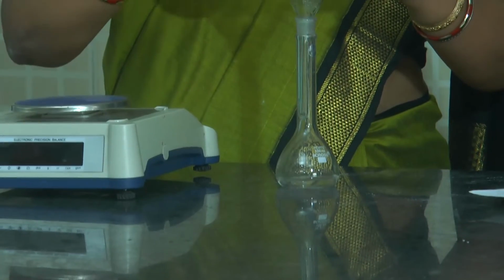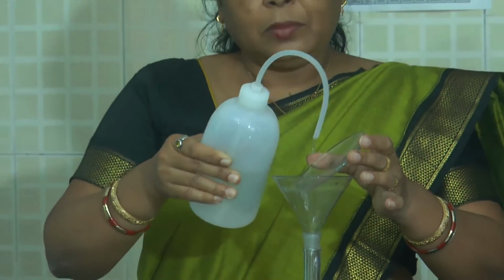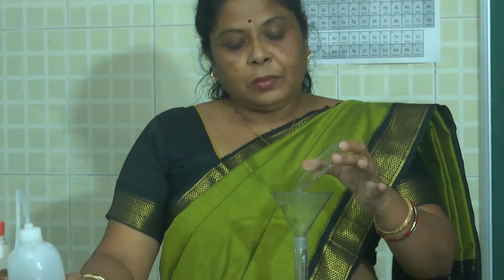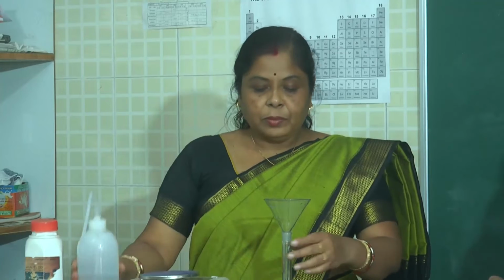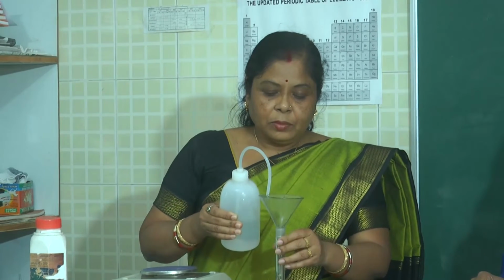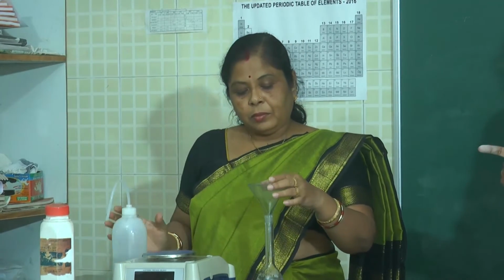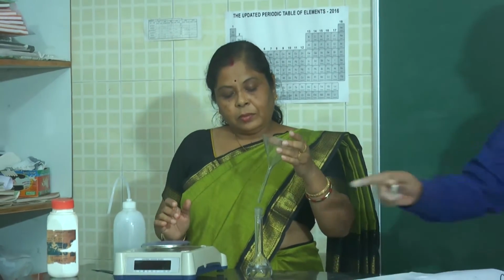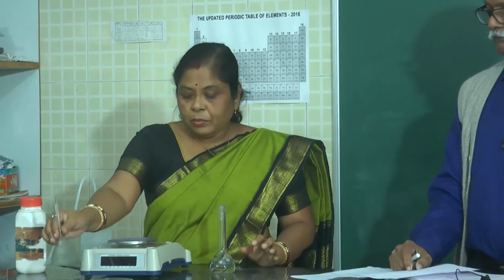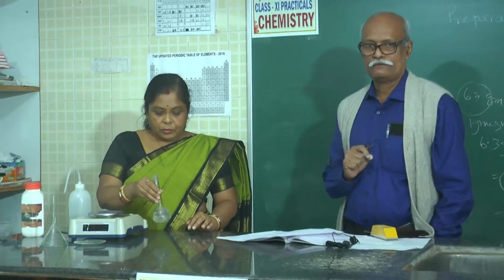If a little variation is there, there will be variation of normality or molarity. That means the apparatus used here is your balance, then your funnel, then your watch glass, then your measuring flask, and a wash bottle.